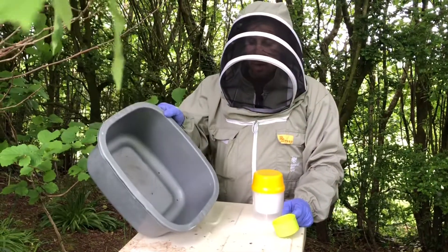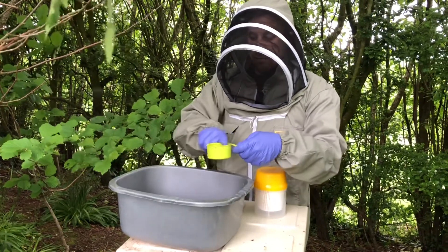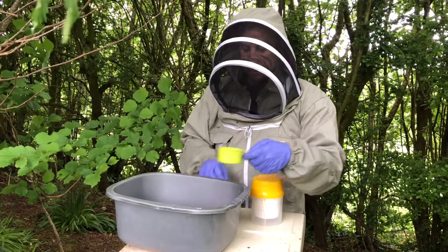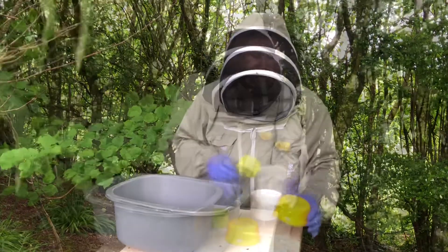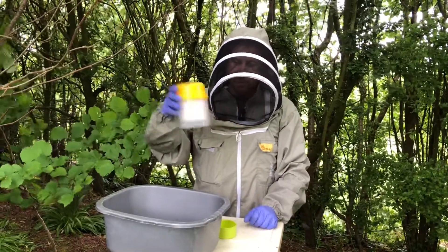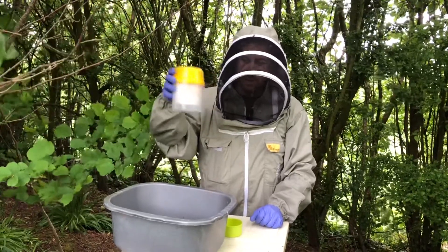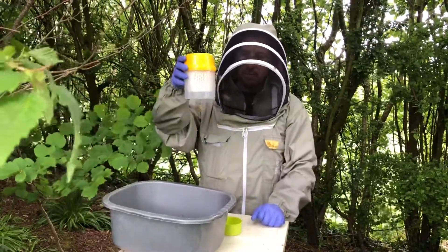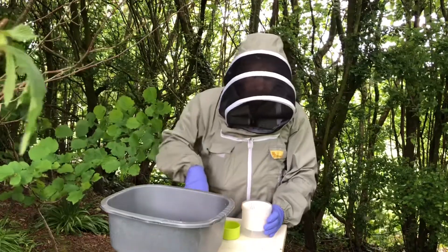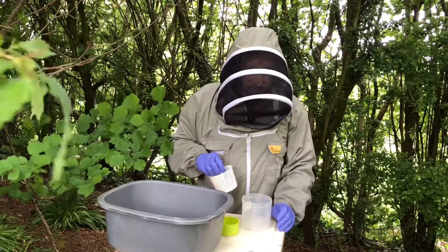I'm going to tap the bowl and knock all the bees into the corner. I'll take a level half-cup scoop of bees and tip them into the alcohol. I'll then put the lid on and shake the bees in a swilling motion for about one to two minutes. That will release the mites from the bees, and you can count the mites through the bottom, or place the device on a light-coloured surface and count the mites easily.